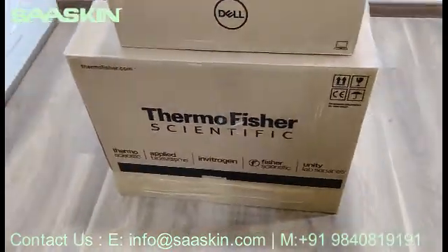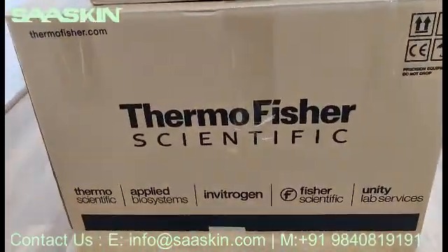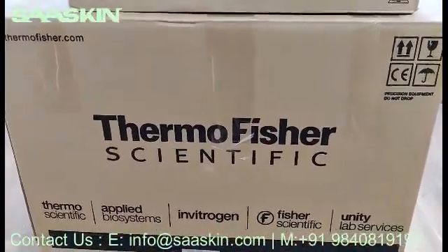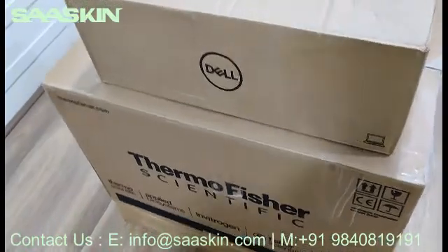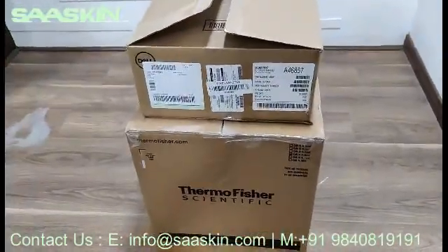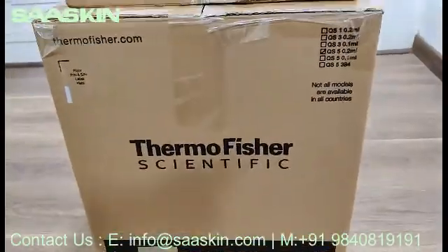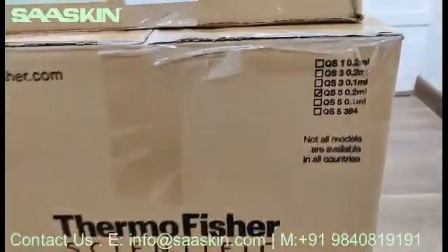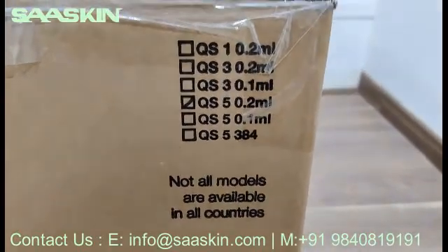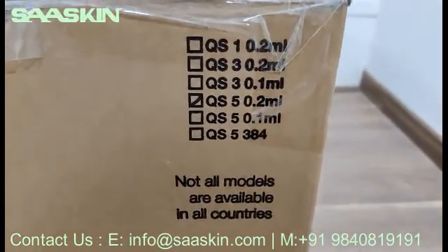I will just go around the box for you. You can see it says Thermo Fisher Applied Systems. I will go to the other side. We have just opened it to ease access. You can see it's QuantStudio 5, 0.2 ml block.